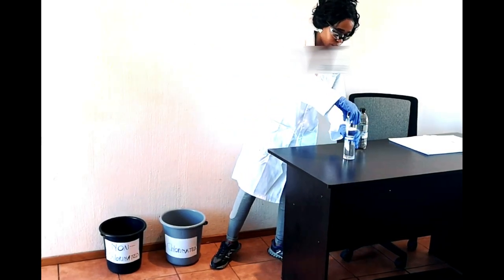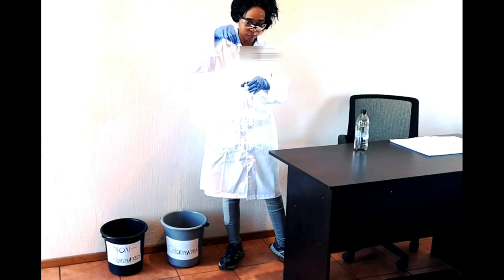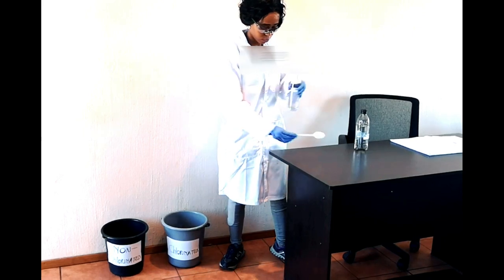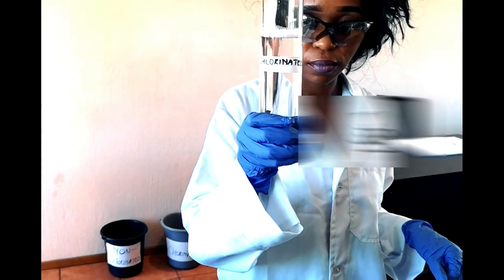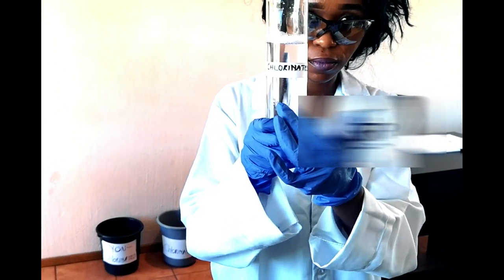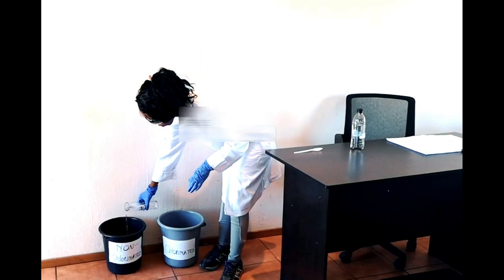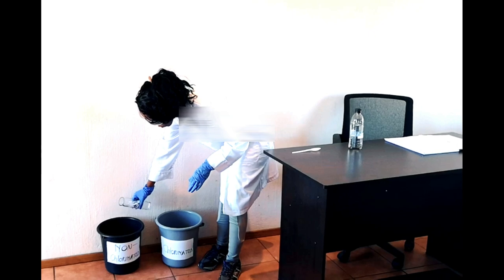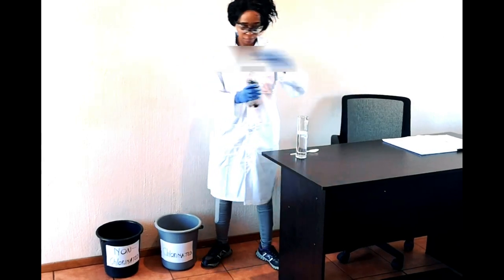This is wrong. If you're not sure of how to dispose of waste, rather ask somebody. Just tell them what's inside your waste, and then they can help you with how to dispose of it, because it is really expensive for companies to actually dispose of waste. If it's not labeled correctly, they will end up having to pay more because there are other things in the container that are not supposed to be there. So if you're not sure, just ask how to dispose of your waste.